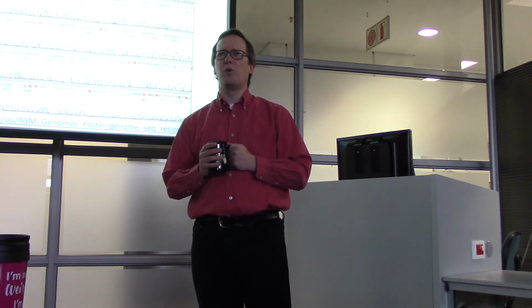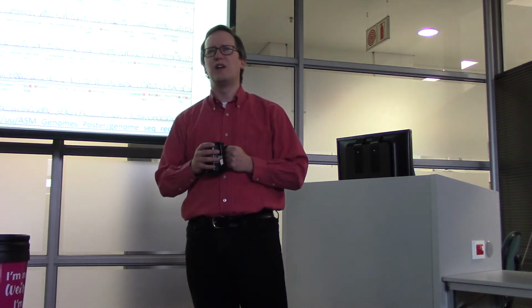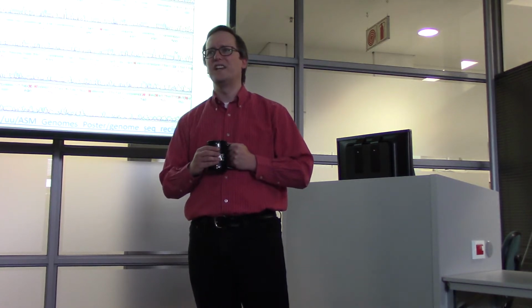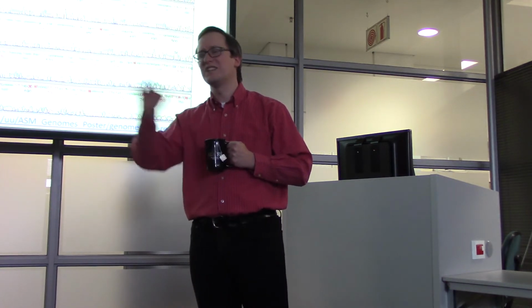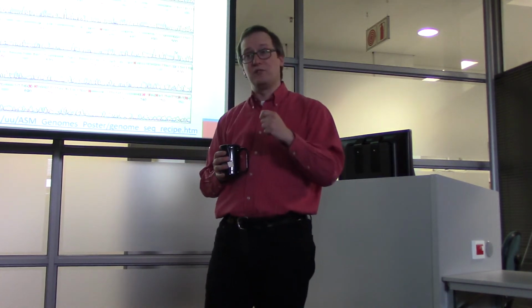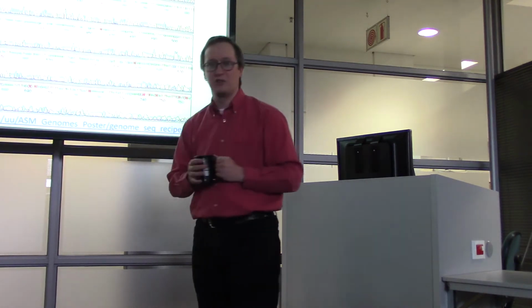So they put in a requirement that the nucleotides be known, I believe, to an accuracy of greater than 1 in 10,000 errors. So that meant that we needed to have statistical models that allowed us to evaluate the quality of these base calls. So Phred was their answer to this.